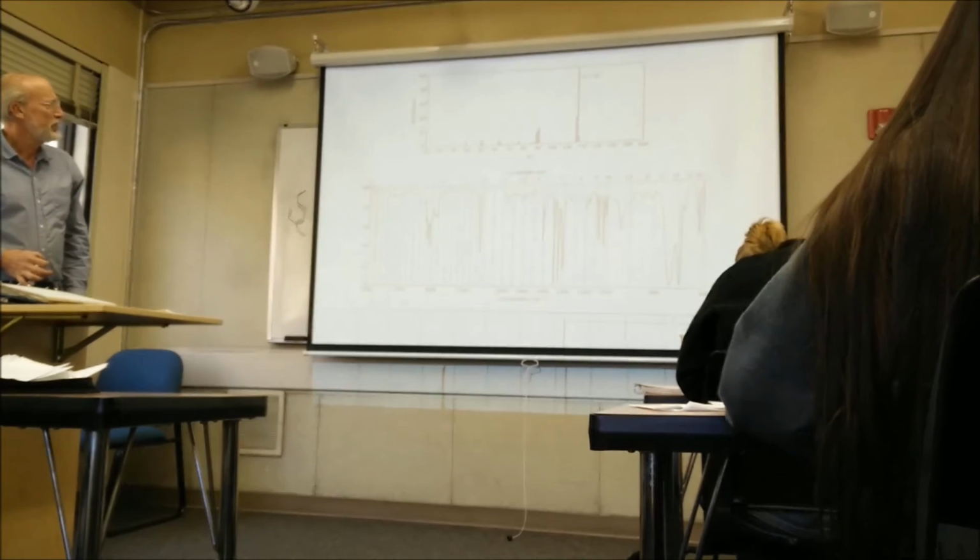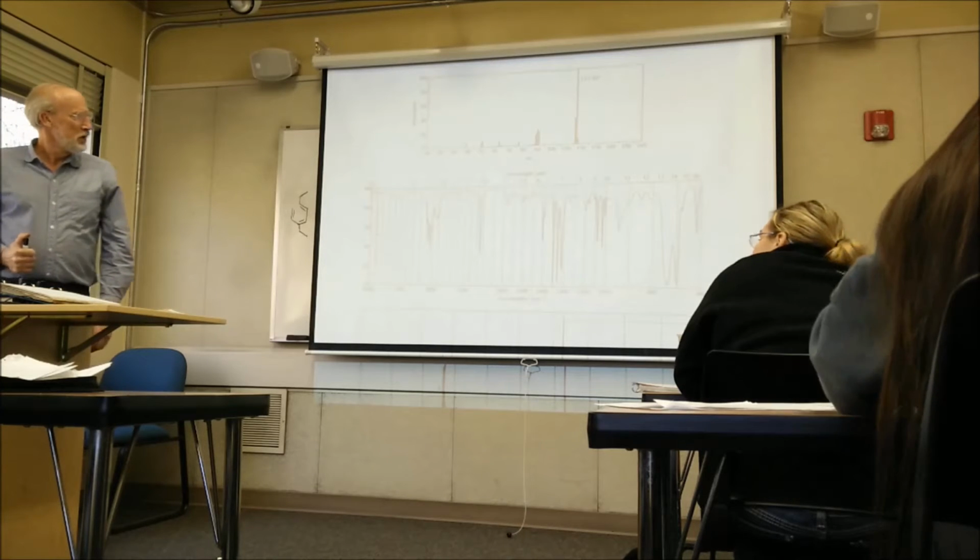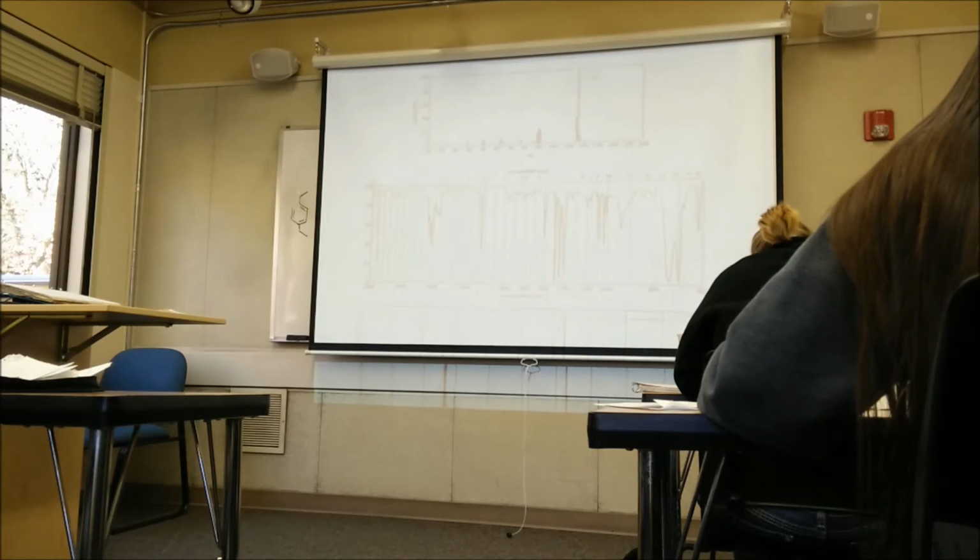Okay. Very few fragments. Yeah. So it must not have very many stable ones. And look at the NMR, only two big things. Only two peaks. One of them split and the other one isn't. Wow, look at those big dips at 700 and 740.